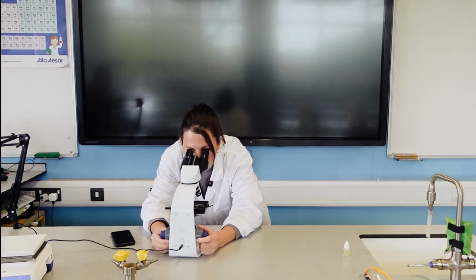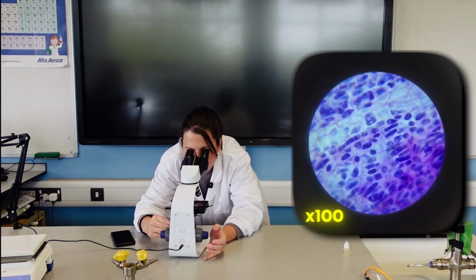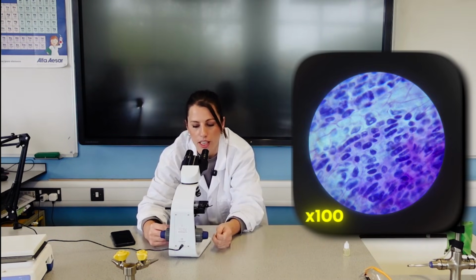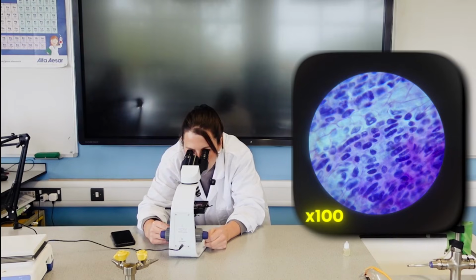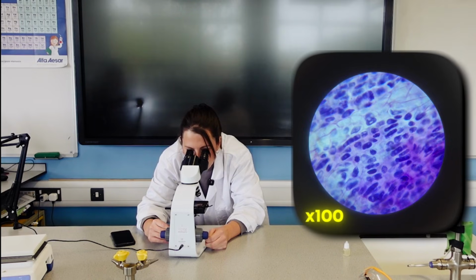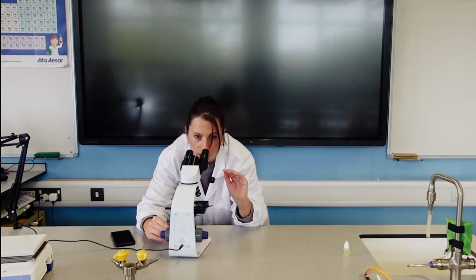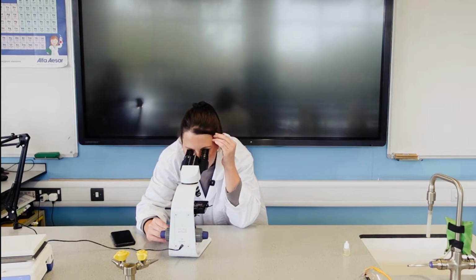So now it's just focusing. So the hardest bit now is, I've got it in focus and I can see all the cells, but this is when students now need to have quite a bit of patience and just move along their slide and try and find a field of view that has any cells undergoing mitosis. So that's what I'm currently doing. There's some that look like they might be in telophase, which I'll show you, but I'm just going to keep looking, because if there's a metaphase or an anaphase, that's a lot more obvious visually. You can see one section here where I've not squashed it enough because I've got several layers of cells, so I needed to squash that a bit more.